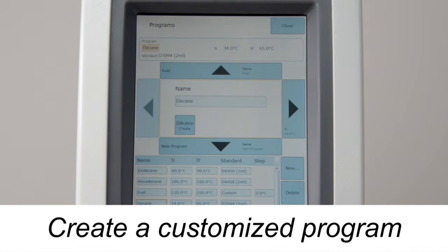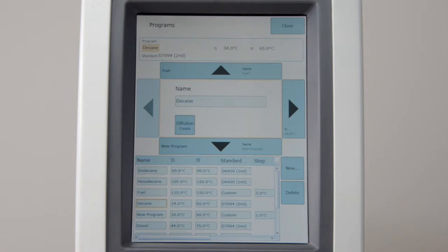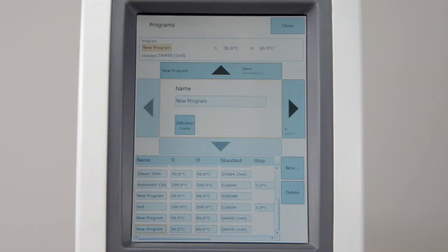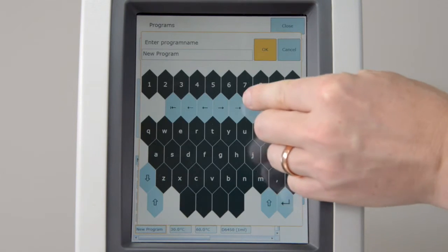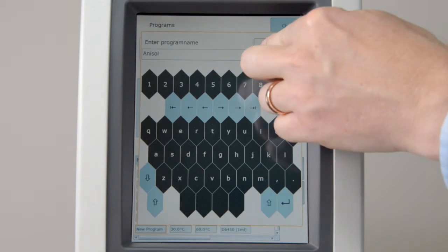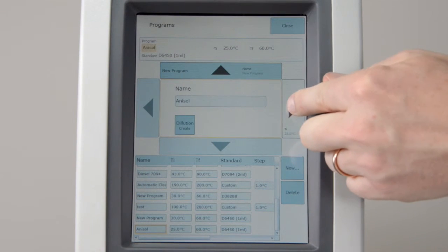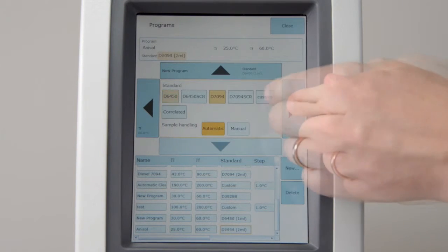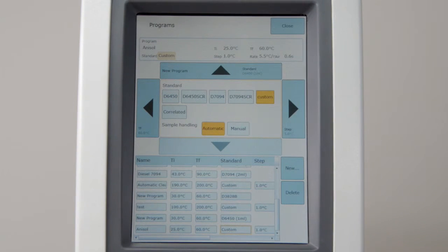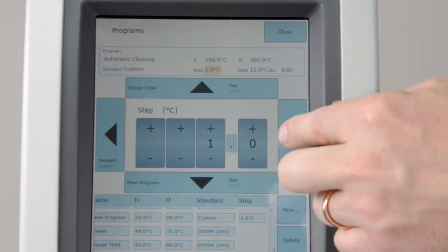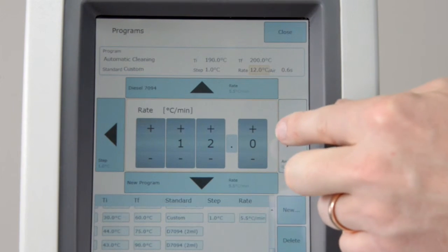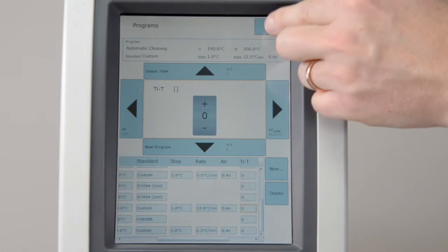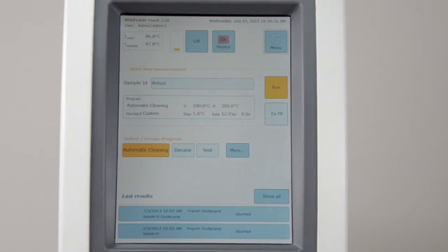Create a customized program. Custom programs allow the user to change additional test parameters. Press New to create a new program. Enter a program ID. Set initial and final temperature. Select Custom Method. A custom method allows the user to define flash point steps, heating rate and air introduction. Select these parameters and press Close to finish the program.